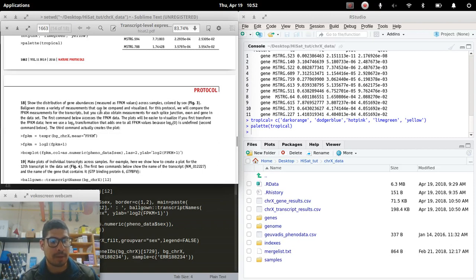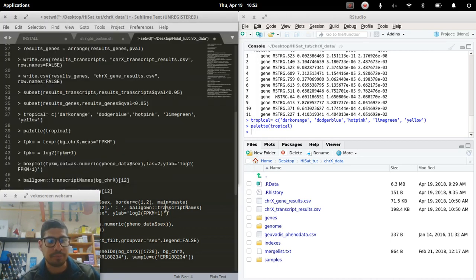So with these specific commands, they're going to be comparing the FPKM measurements for the transcripts, but it can also be compared for splice junction, exon, and genes in the data set. But for this, we're just going to be looking at the transcripts. So we'll go over here, we'll do FPKM.